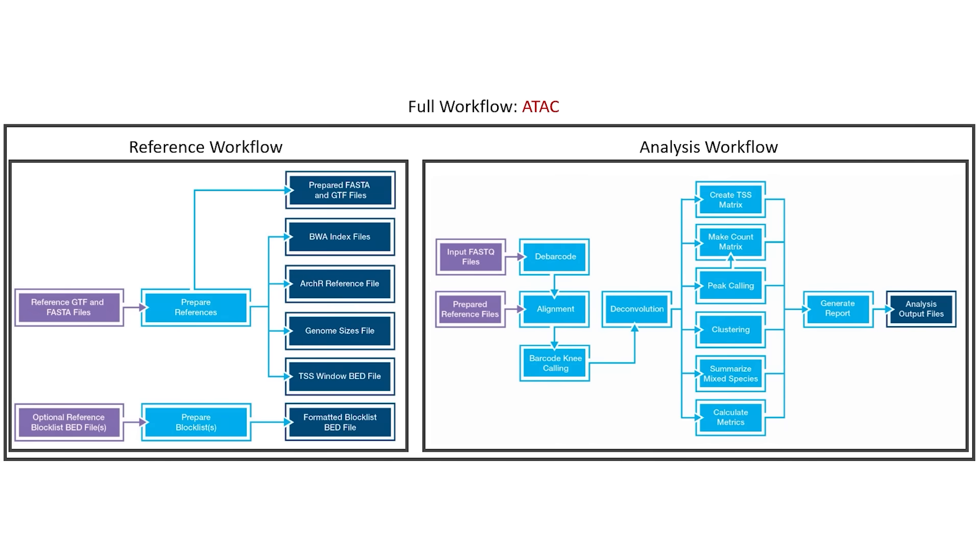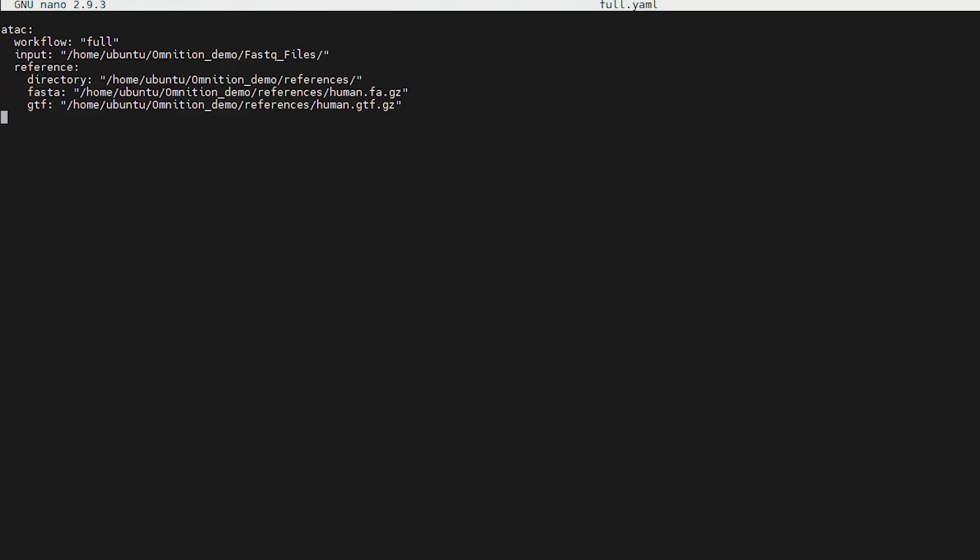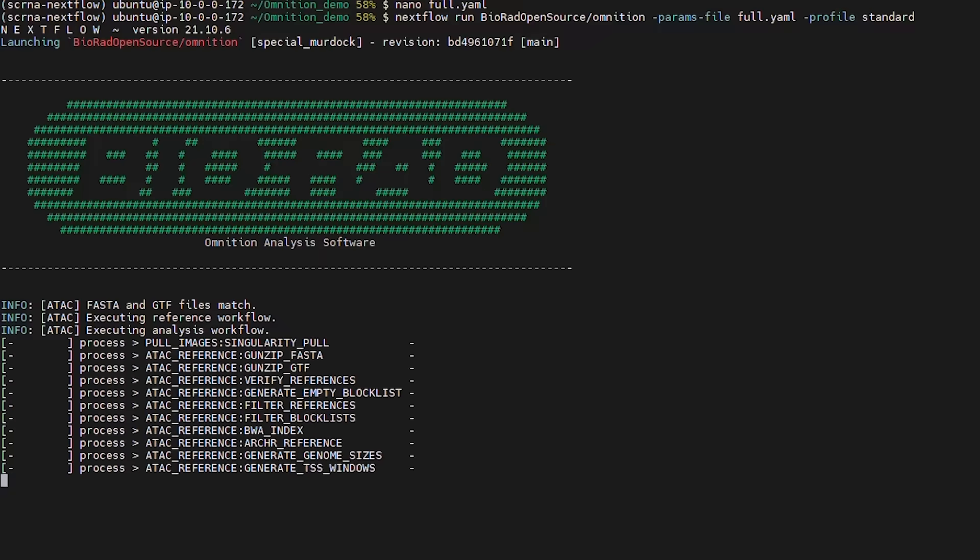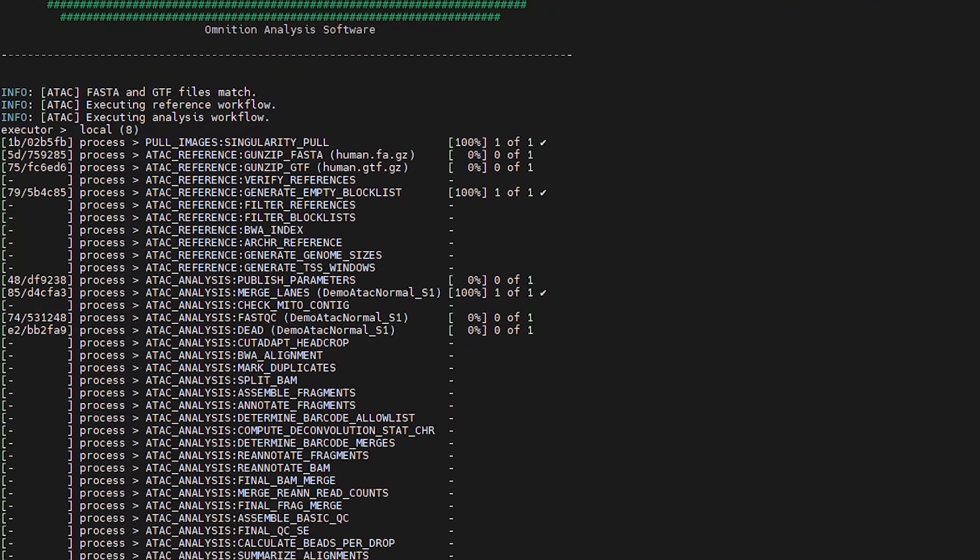Finally, we'll review the full workflow, which contains all the steps performed in the reference and analysis workflows. To run the full workflow, the analysis YAML file must be changed. Set the workflow parameter to full. You don't need to include a block list file. Once you have completed your full workflow YAML file, you can save it as full.yaml. Then you will start Omnition in the same way as in the analysis workflow.